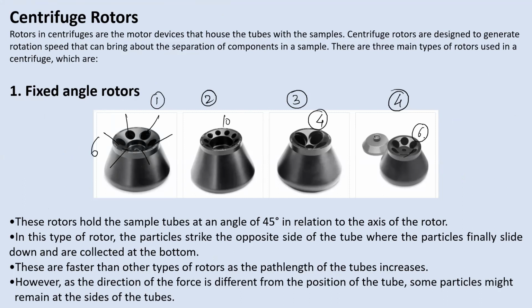So you will always see that there are an even number of holders, because I told you, if I insert a tube in, say, this holder, then I will have to insert another tube exactly opposite, exactly in front of it. So this is the holder. I will have to balance them.